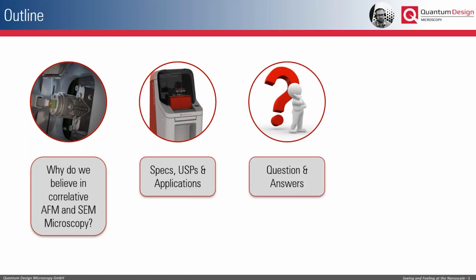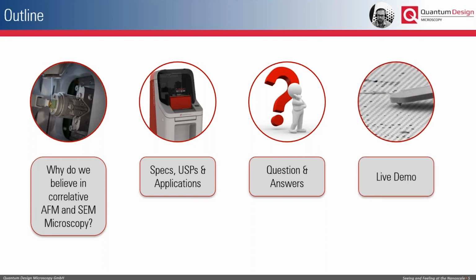After that, there will be some time to answer your questions. If you have any, as Marion already said, please use the chat during the presentation to type in your questions. And then in the last part, we will show you a brief live demonstration of the FusionScope tool done by my colleague Lucas, who is at the moment already sitting in the lab in front of the instrument and will take over after my presentation.